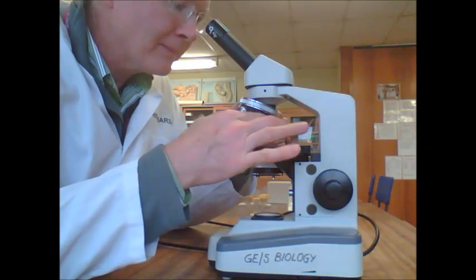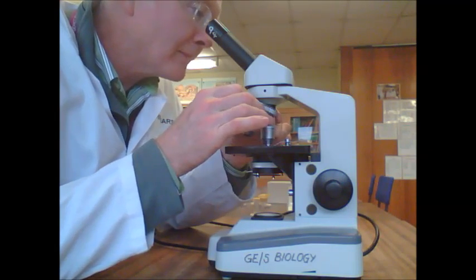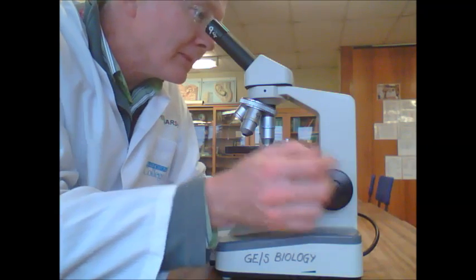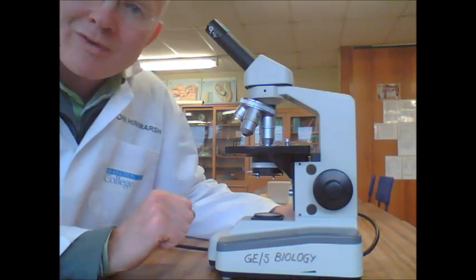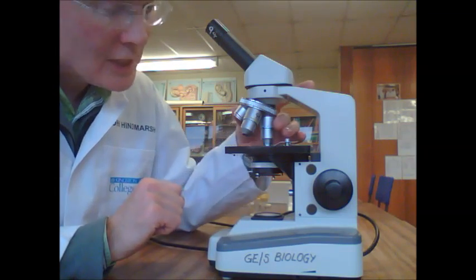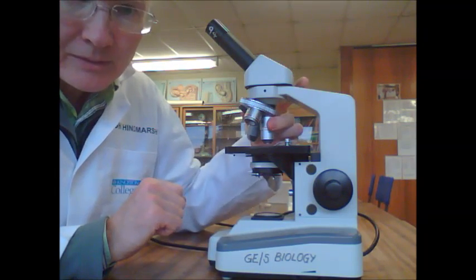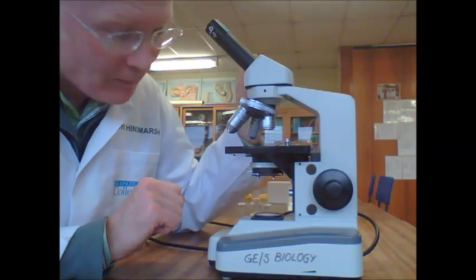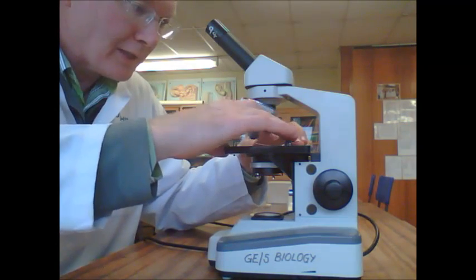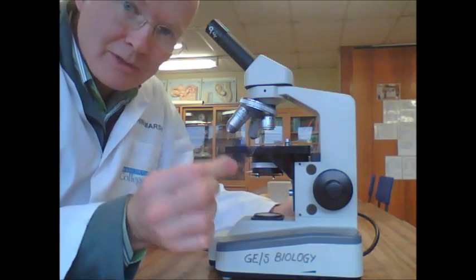If you get lost, you can always go back down to low power again and re-find what you're after. Check that your focus is right, and you can go back and check again on your high power. When you're ready to finish, return back to medium, then back to low power before you take out the slide. Then lift the clips and take out the slide.